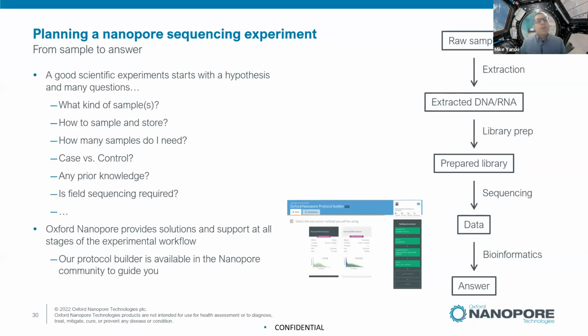So when you're thinking about your library prep, a lot of people with short read sequencing in the past have just worked from the top down. They take the raw sample. They have no control over the library prep because the short read sequencing companies dictate the length of that read. And it's all PCR amplified, and PCR amplification strips away a lot of the modifications, which makes the library perform uniformly.